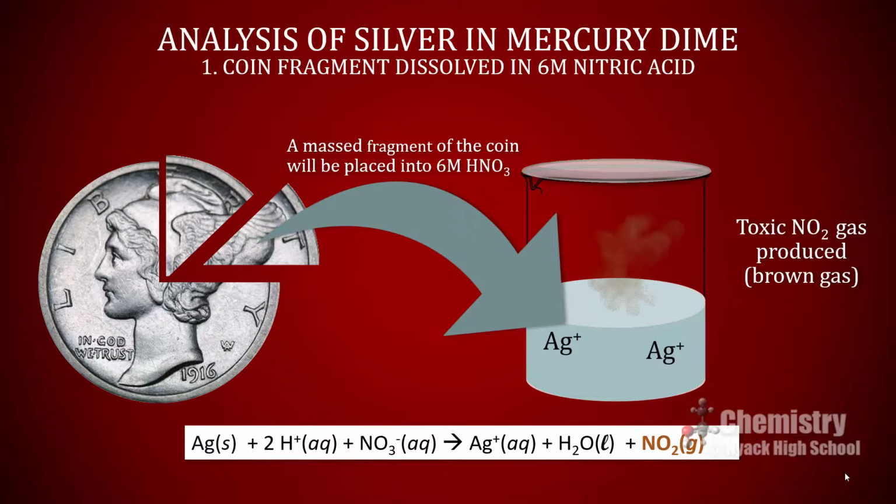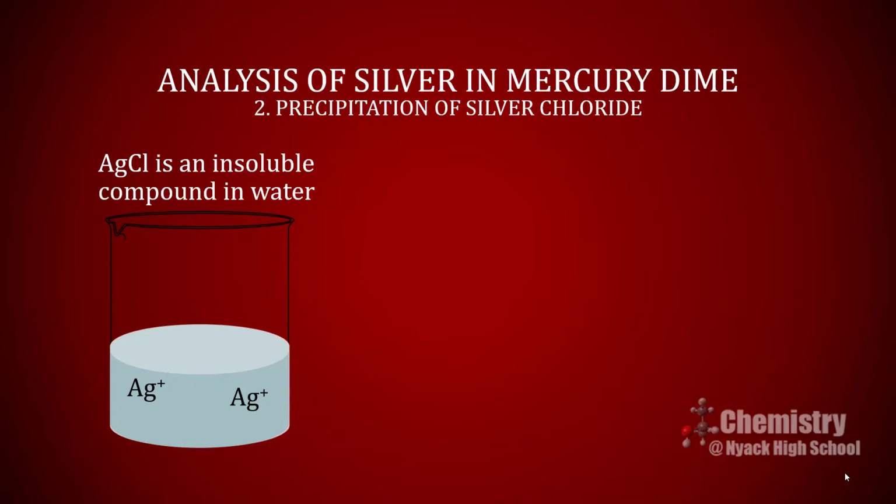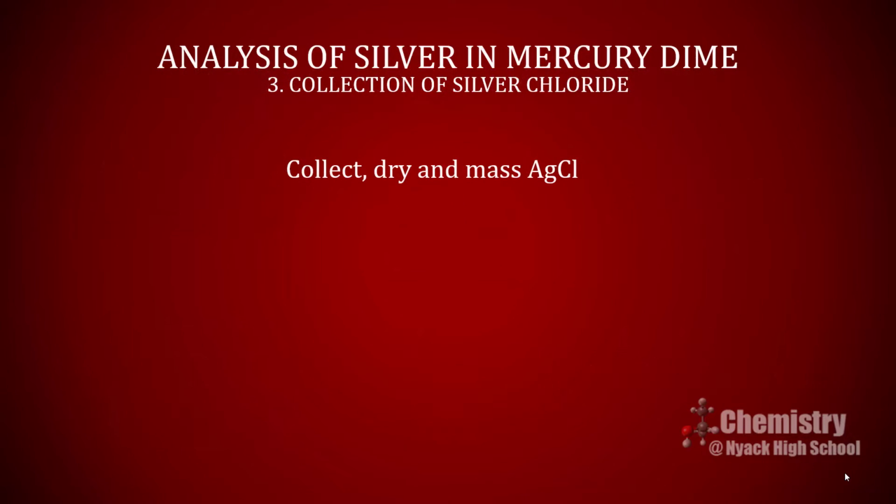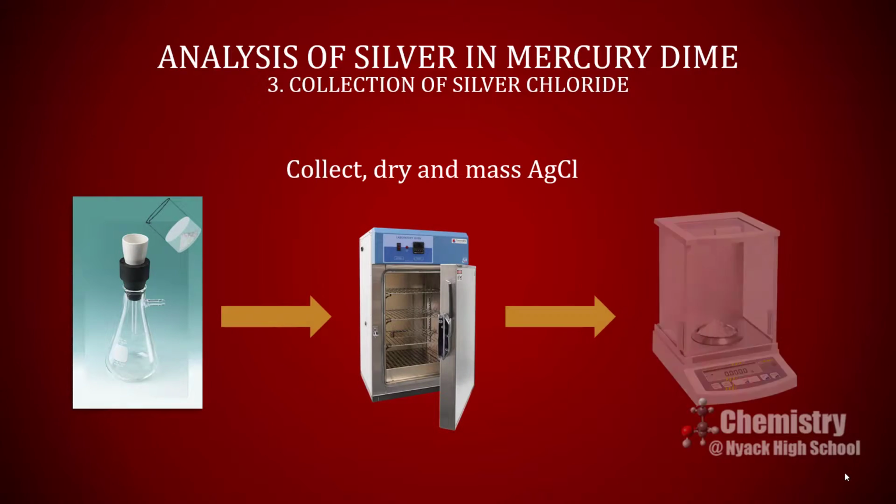The resulting mixture will contain dissolved silver and copper ions, among other ions. The reaction below shows the production of the silver ions as well as the toxic nitrogen dioxide gas, which explains why we will be doing this procedure in the hood. The next step is to precipitate the silver ions by adding a solution of sodium chloride. Silver chloride is an insoluble compound, and so the addition of sodium chloride provides a source of chloride ions, which when combined with silver ions will cause the precipitation of silver chloride. We will then collect the silver chloride by vacuum filtration, as before, dry the silver chloride overnight, and mass it the following day.